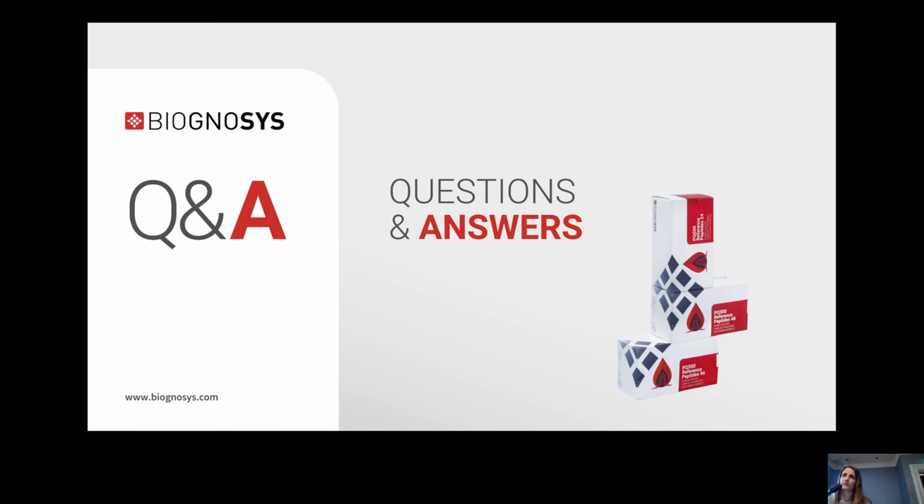Or maybe two actually. So I assume it's a scheduled method, right? With the SureQuant? No. SureQuant, you don't need any scheduling. So when you detect the heavy, the light gets measured. Yes. So that's why it's so easy to transfer across chromatographies in this case. But now that I asked, well, we've done it ourselves, so it's not scheduled.